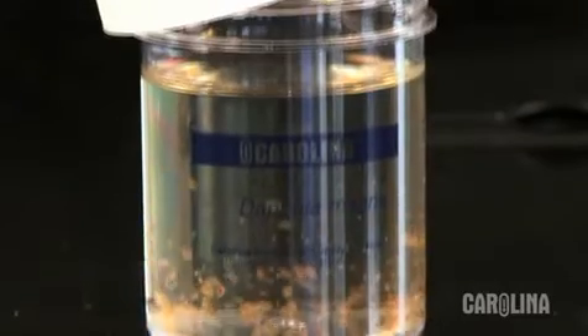Hi, I'm Mary Haugen, a biologist with Carolina Biological Supply Company. Today I'll discuss care and handling of our popular culture, the Daphnia.